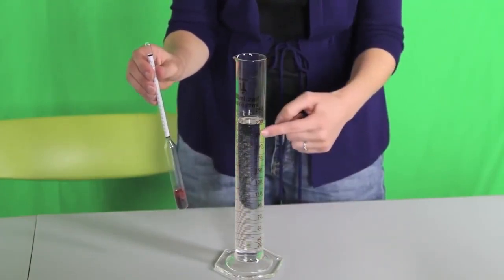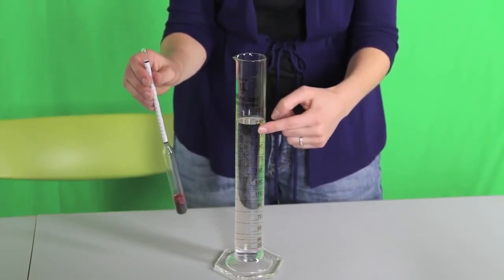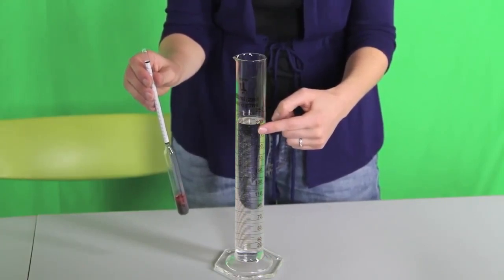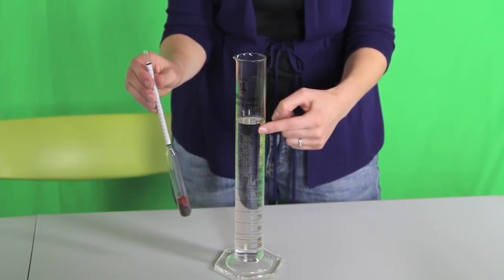First, fill the test tube with a sample of liquid, and in this case I'm using water. Don't put so much liquid into the test cylinder that it overflows when you put the hydrometer in.